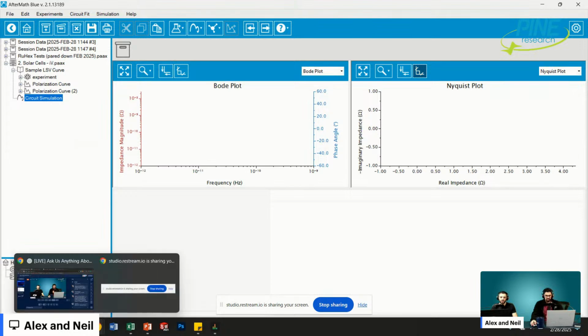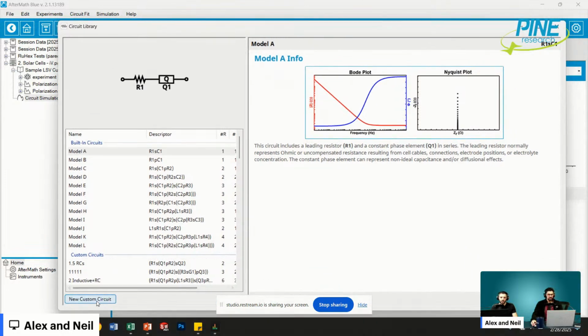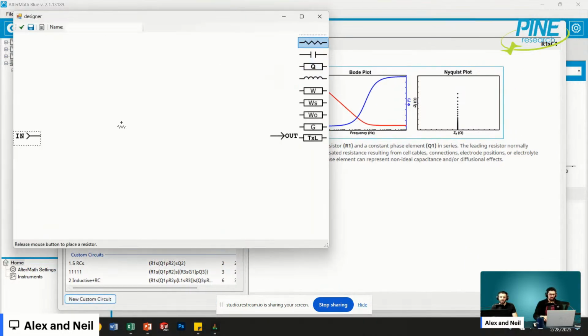So for example, what was the person asking about, Warburg or whatever else? I'll build one and show you where they come into play. I guess that'd be helpful. So the typical Randles circuit is probably what you're most after here. I'll just use a plain Warburg just for simplicity. Let's make this the same number. So this would be like a Warburg Randles circuit.